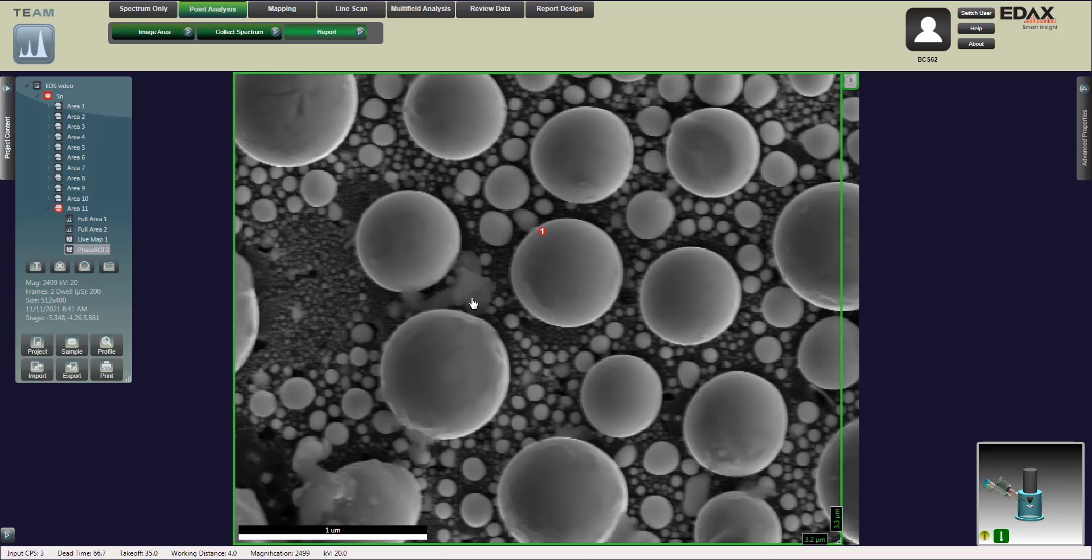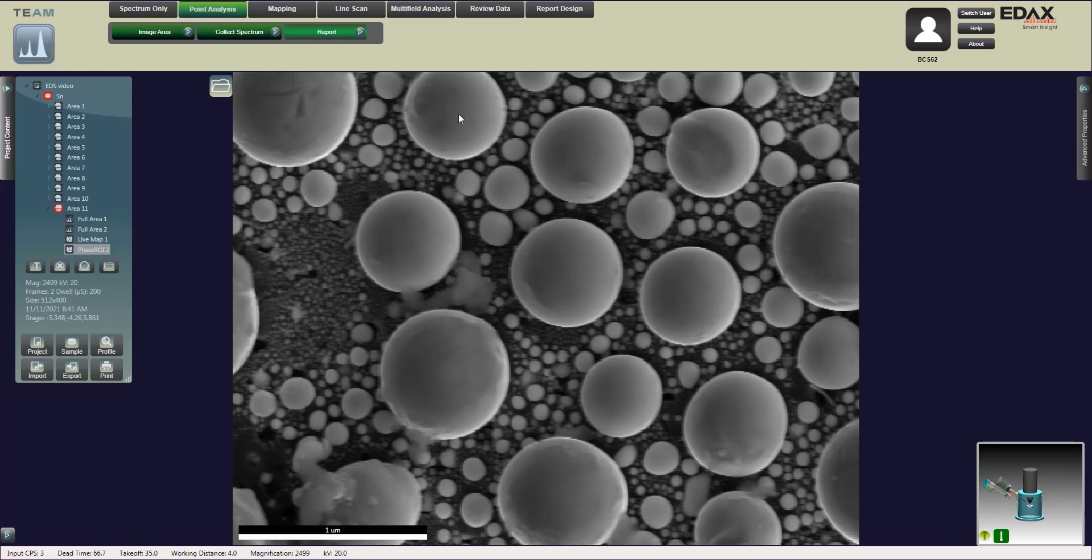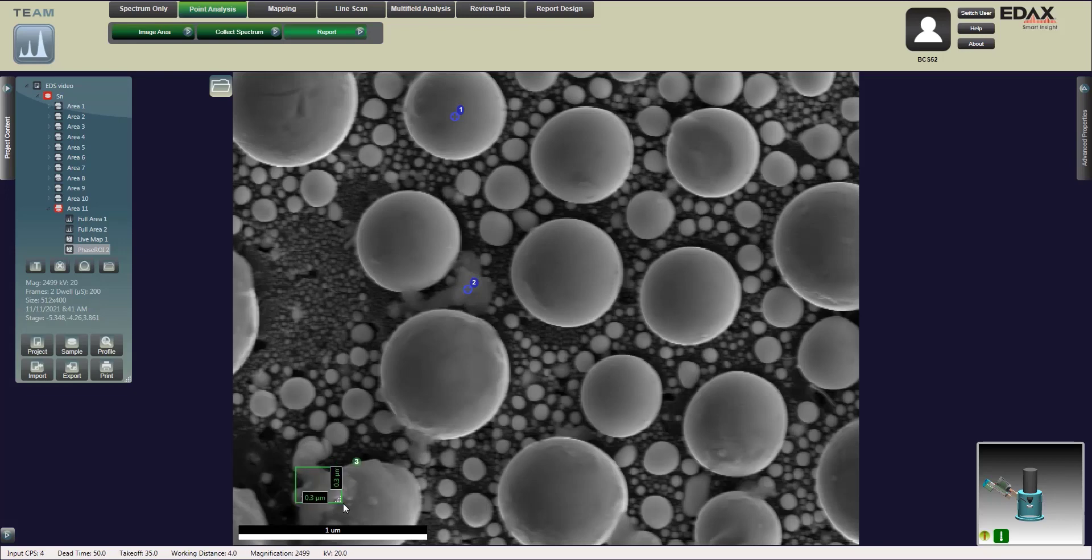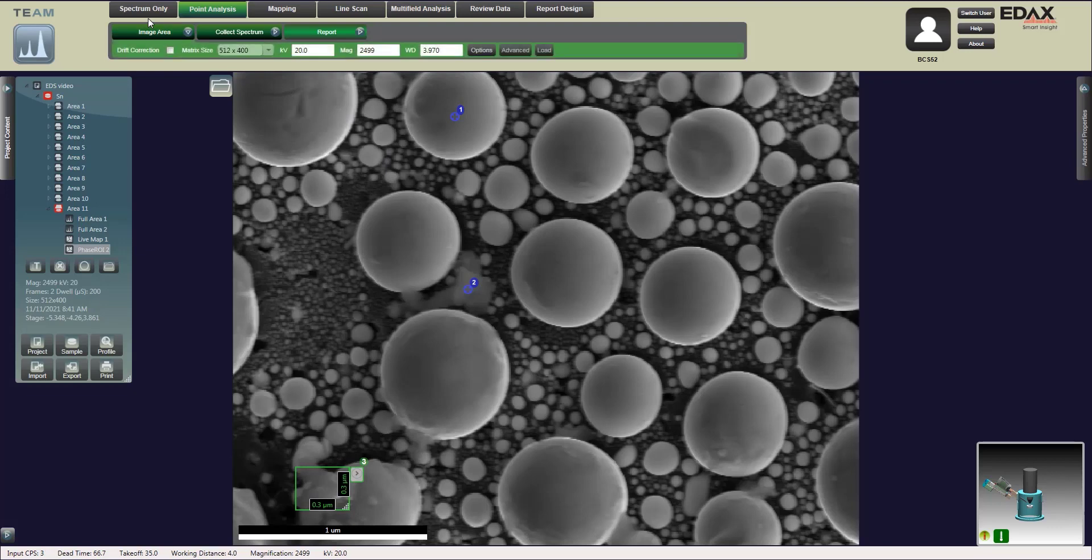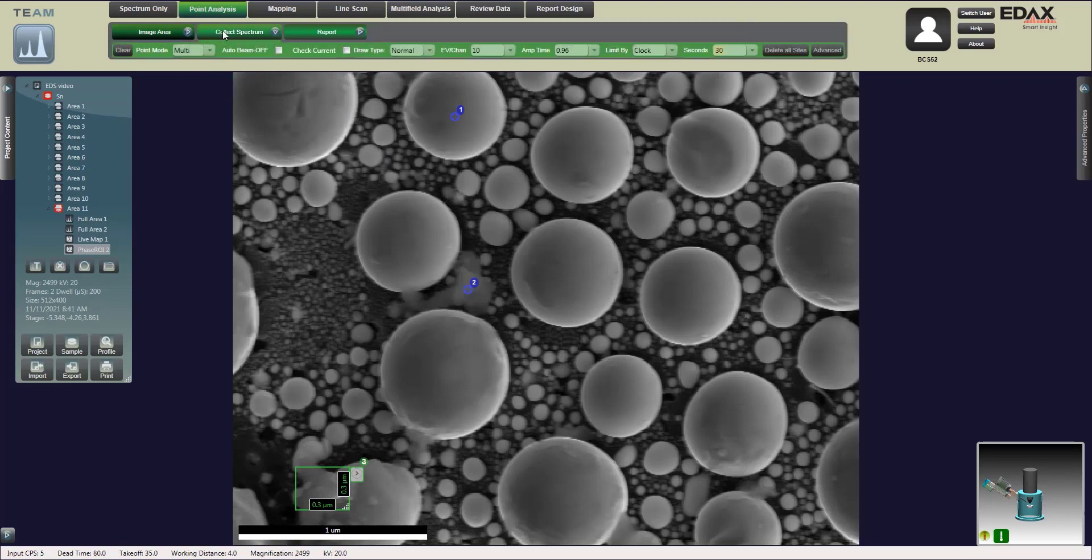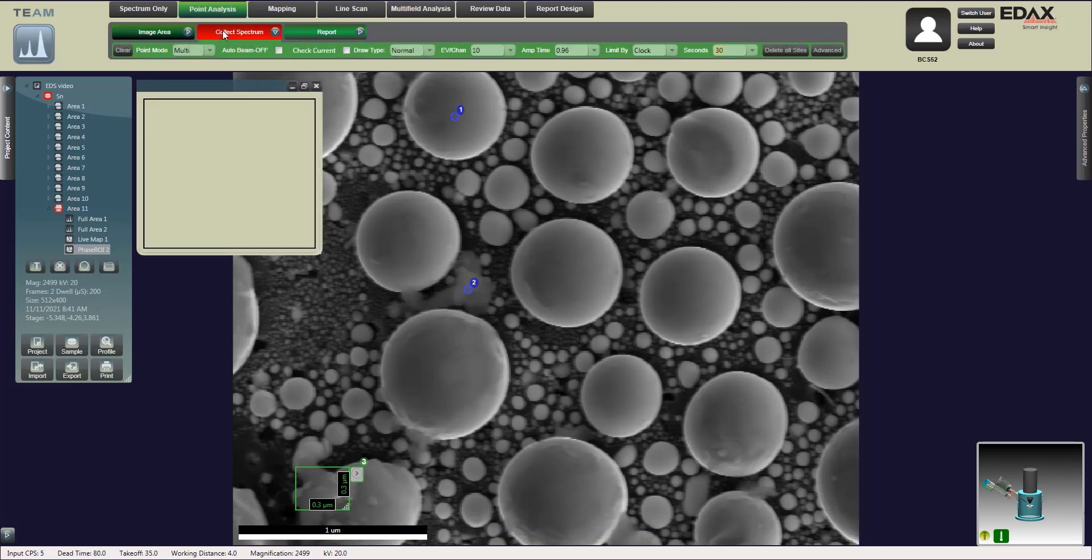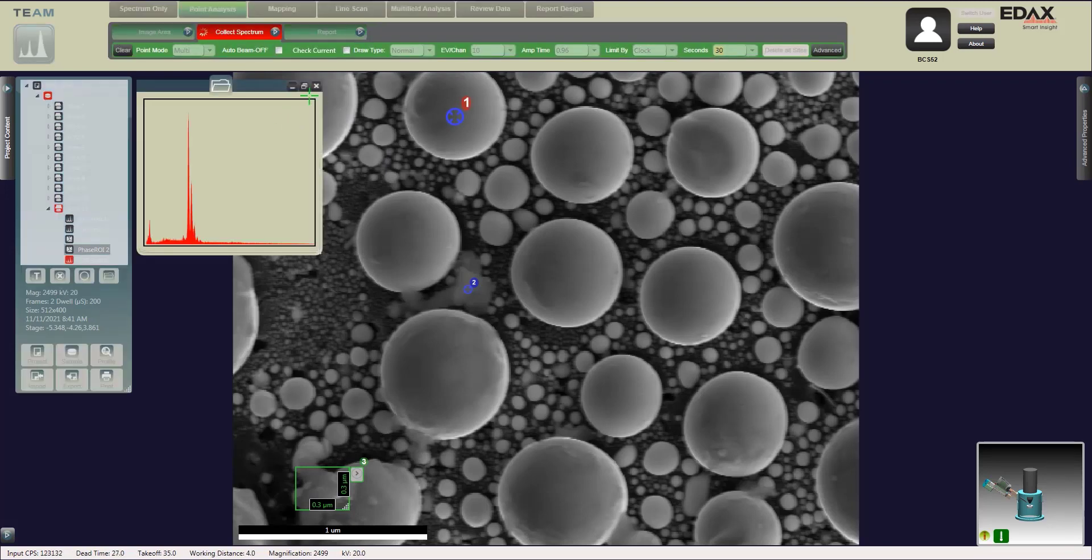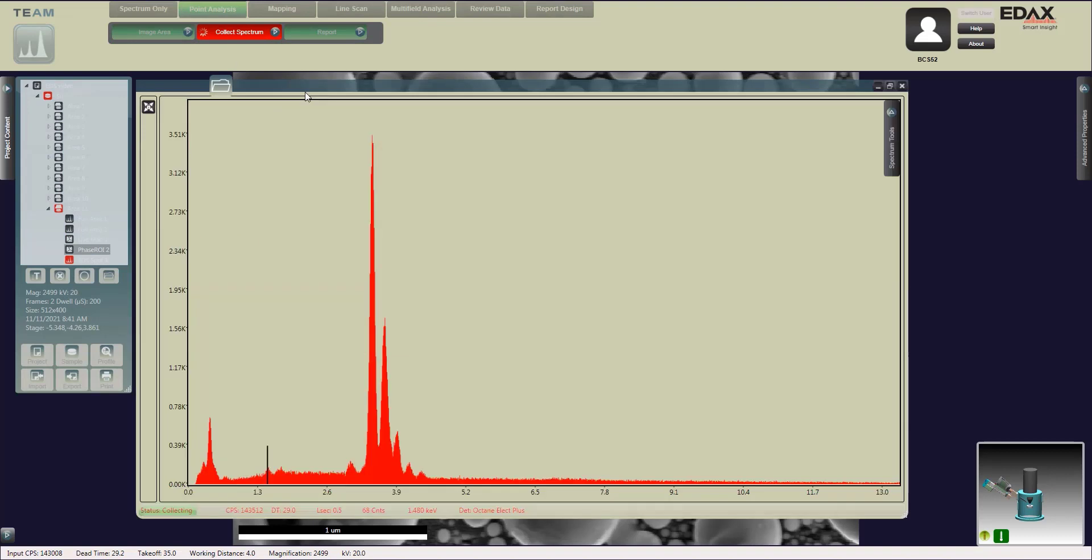Now along with point analysis, you can either get an average of a whole area or select individual points. Here I'm going to select a couple points. One directly on a tin sphere. Second point looks like it's on some kind of contaminant, along with that third box. They look like two contamination areas.